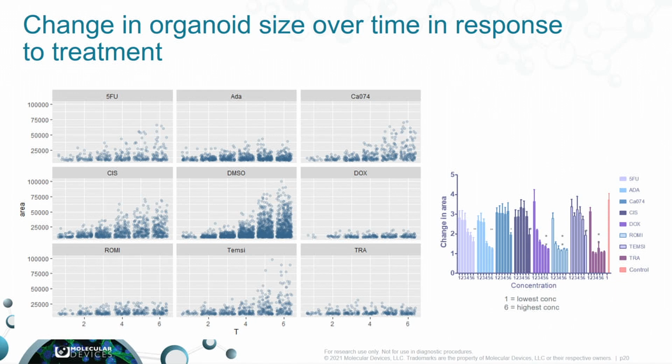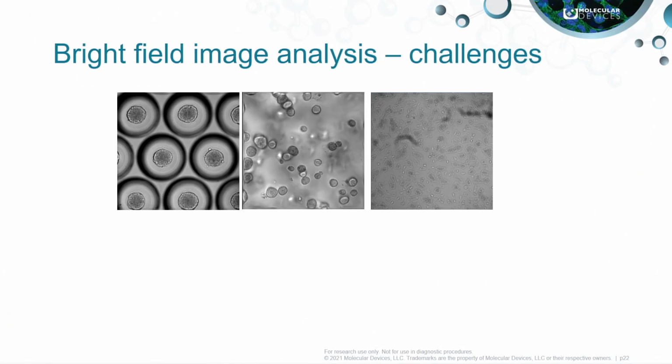And so I'm going to switch gears a little bit now and talk about analysis, because I want to introduce the idea of image-based, deep learning-based segmentation to help us identify organoids that are growing in culture over time, and not having to be dependent on fluorescent images.